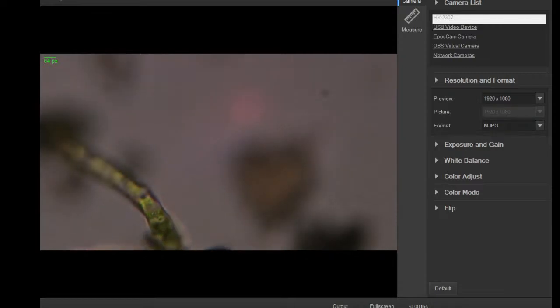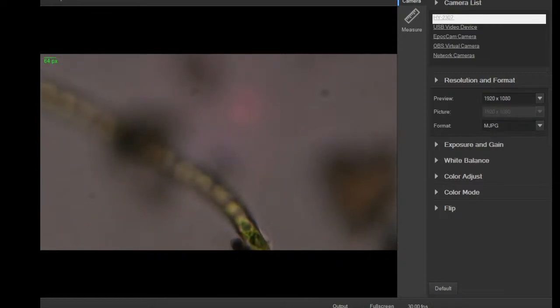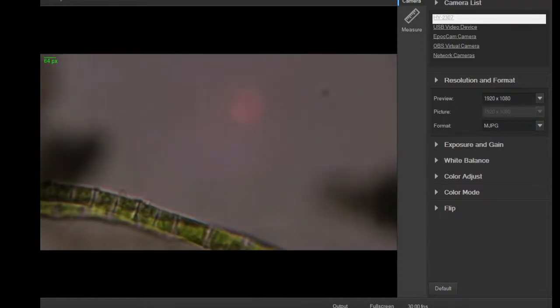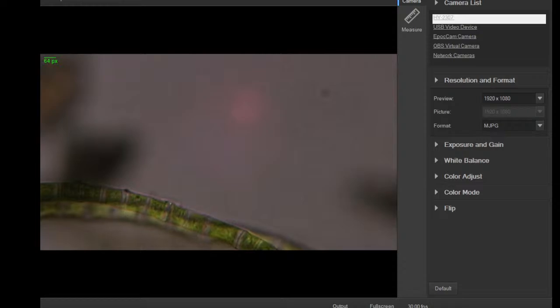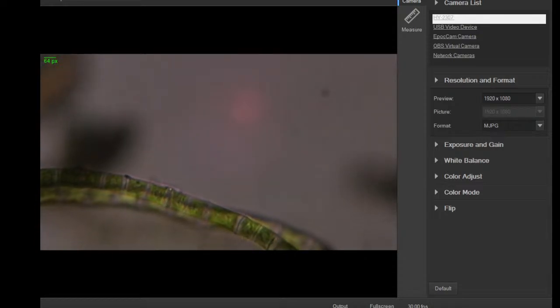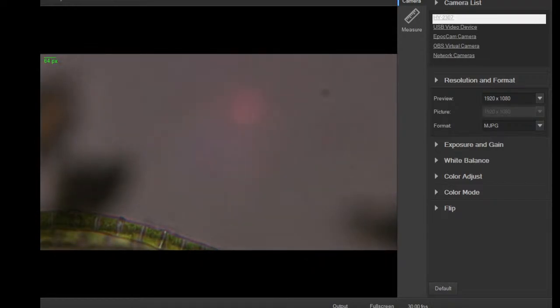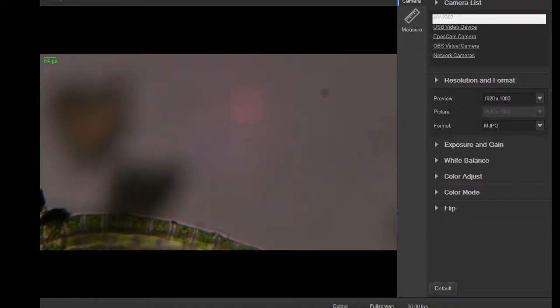It's pretty small. This might actually be a blue-green algae, which is a type of cyanobacteria related to actual bacteria, but it's photosynthetic and colonial. But they're so small. Usually when they're this small, they're more like the cyanobacteria. But I have to get a better look at it. But pretty cool.